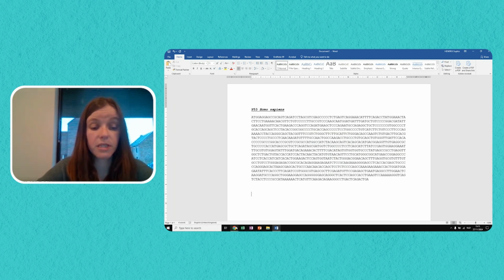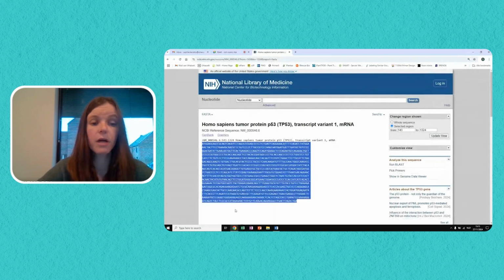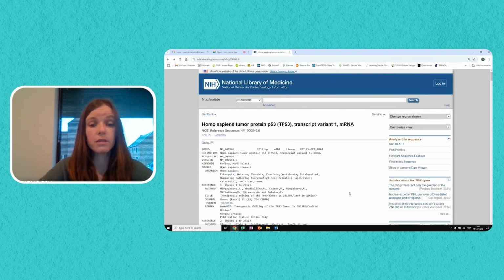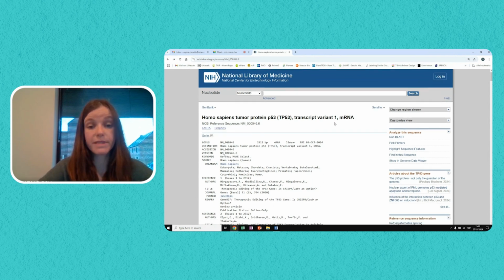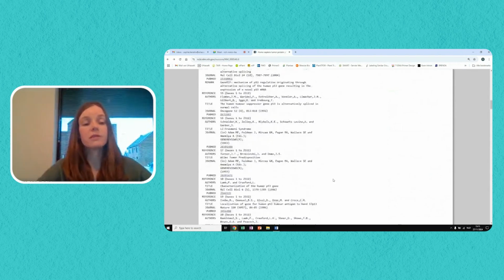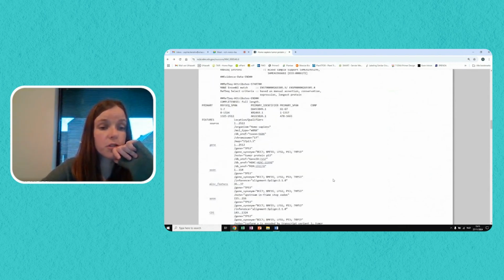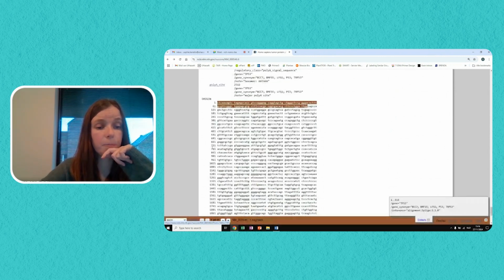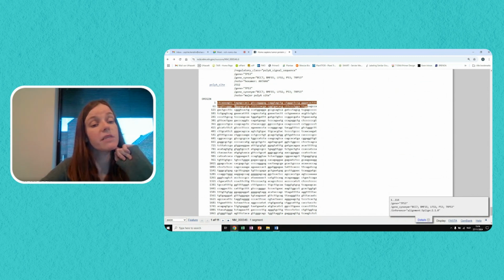And we can do this by going back to the mRNA sequence. So we will return to the page for transcript variant 1. And what we will do now is in this features list, we will look for the exons. The first exon that I find, I can click. And then you will see that here it highlights the sequence corresponding to exon 1.